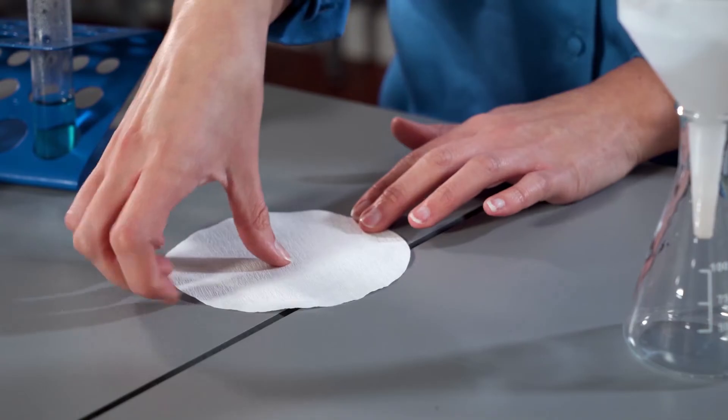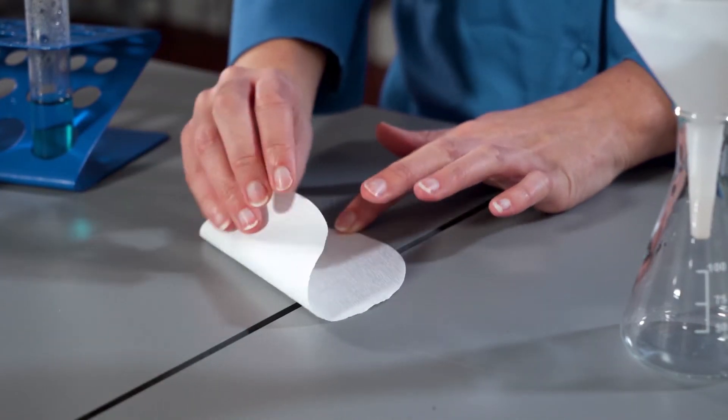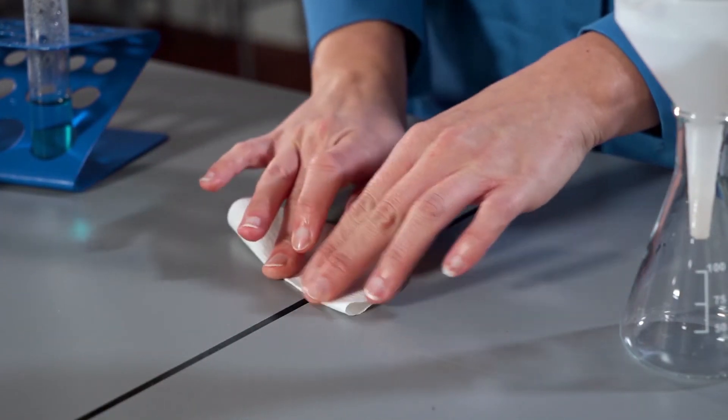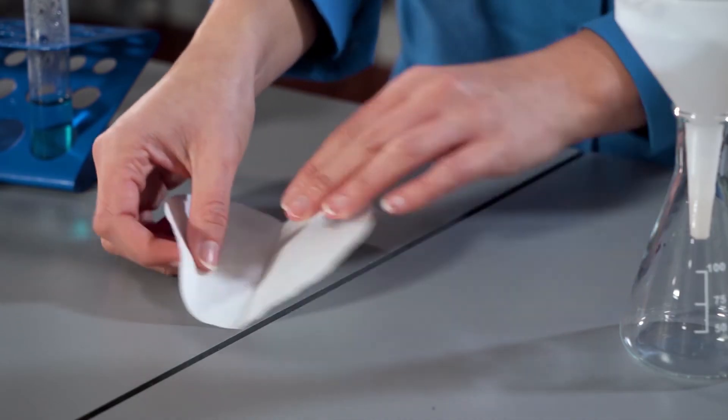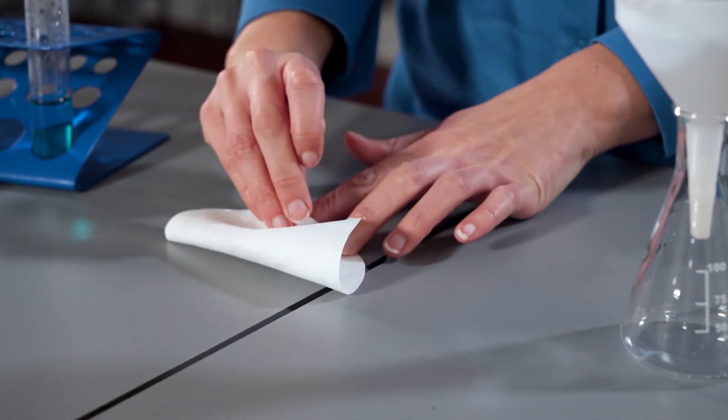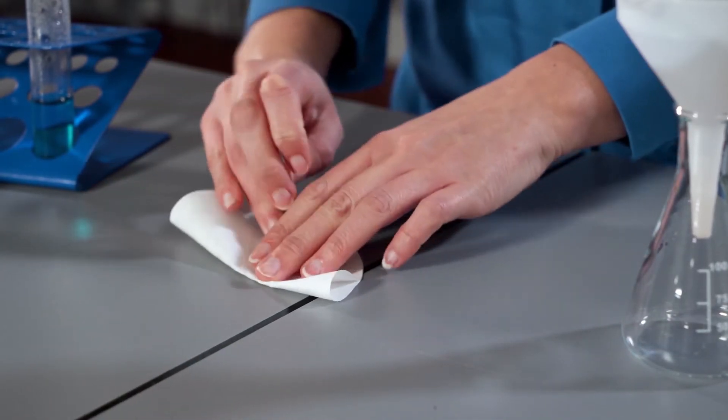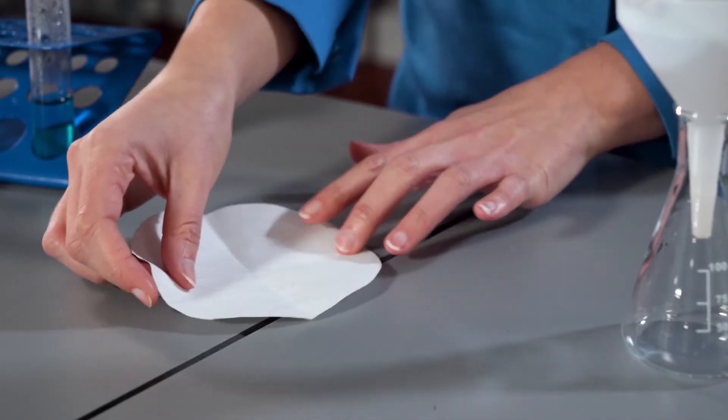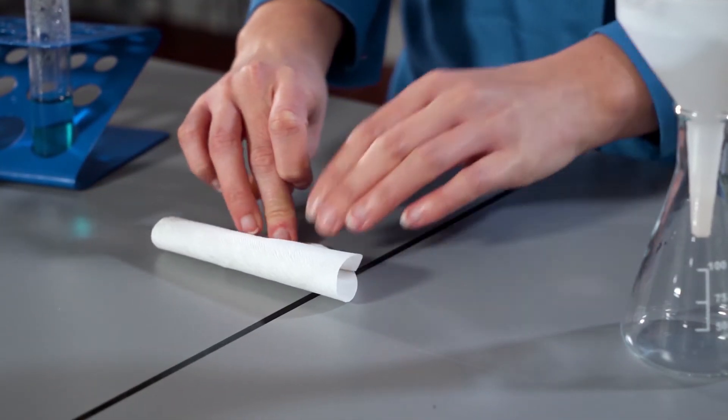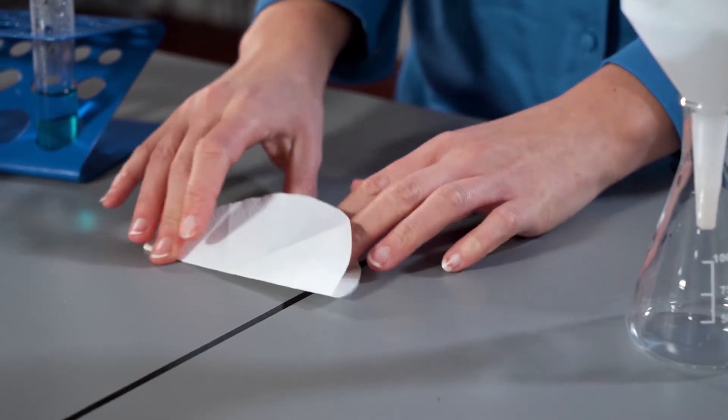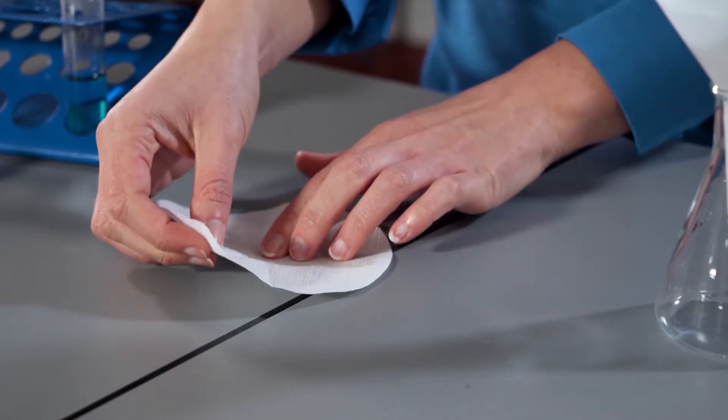To do this, we'll start by folding some filter paper in half, opening it up and folding it in half again, opening it up half again, and once more in half again.